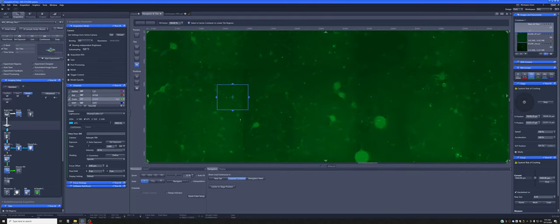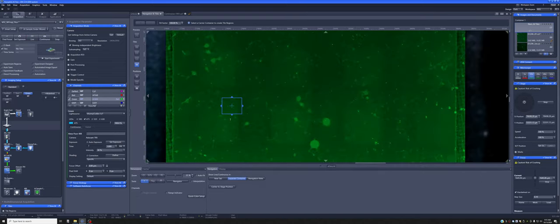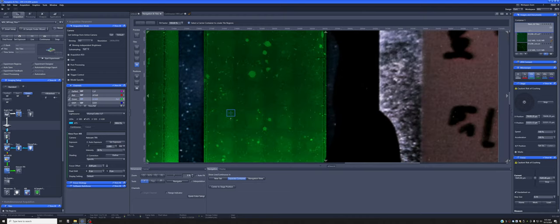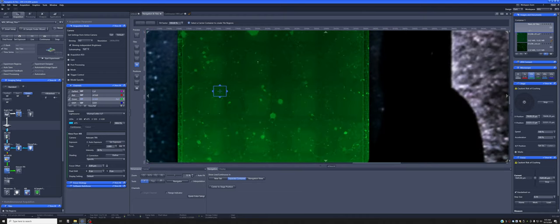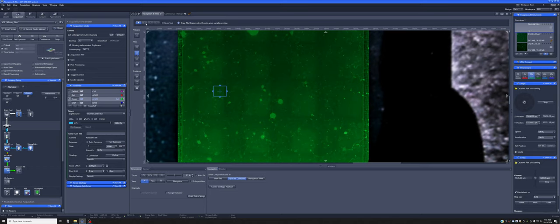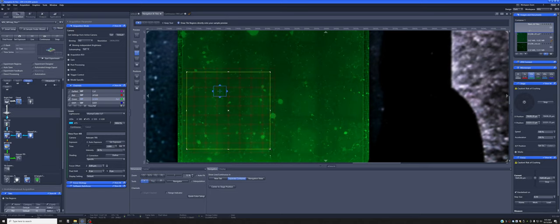Once we have that, what we can say is, well, you know what, I actually want to get this whole region at that higher resolution to be able to make a quick map at higher resolution than the original one so that then I can do confocal. And you can do that using all the tiling tools that you're familiar with.